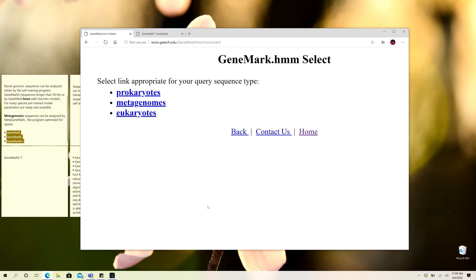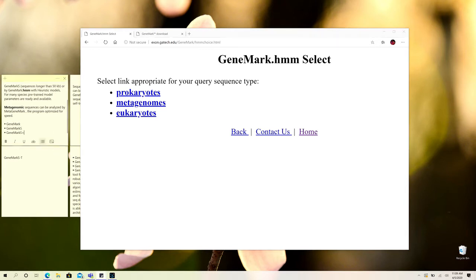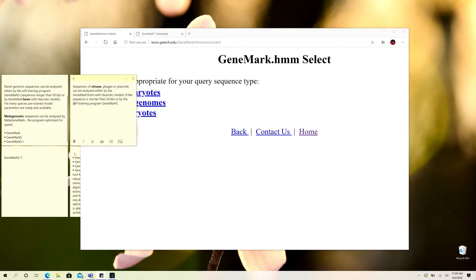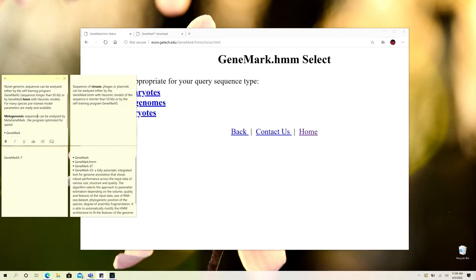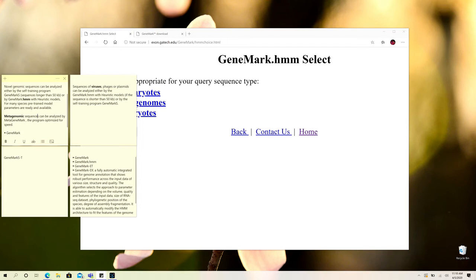We have already prepared a set of notes that can be utilized for better and thorough knowledge or comprehension about GeneMark. First of all, you can utilize novel genomic sequences for the GeneMark tool as input for the prediction of genes.